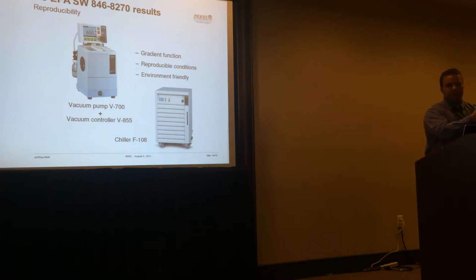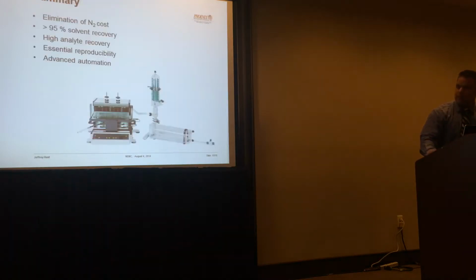Your solvent is sitting in a 10 degrees Celsius chilled zone, so if you're not there when it's over, it's not the end of the world. It's still safely stored in the 1 milliliter appendage.